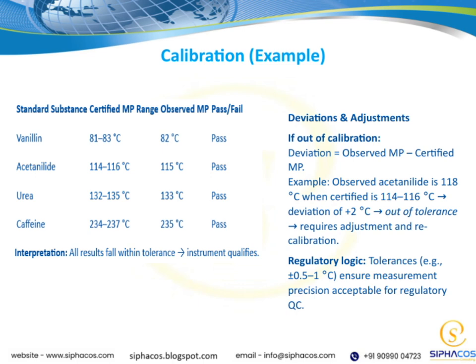In terms of calibration, the key is to regularly check and adjust our instruments so that our measurements remain accurate and reliable. This process is essential for ensuring the quality and validity of our results over time.